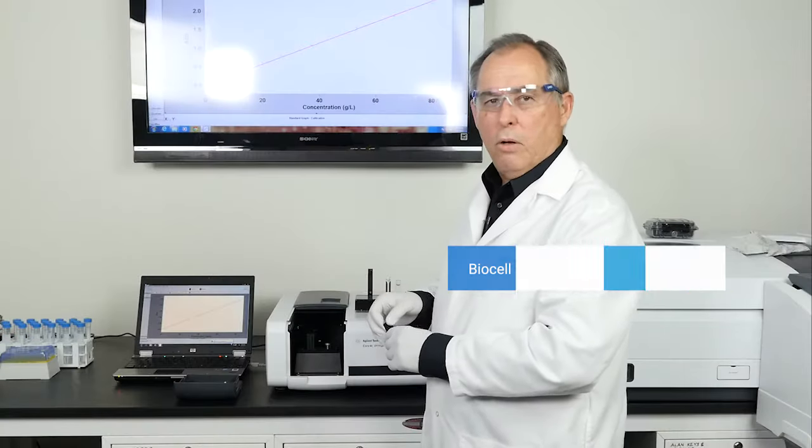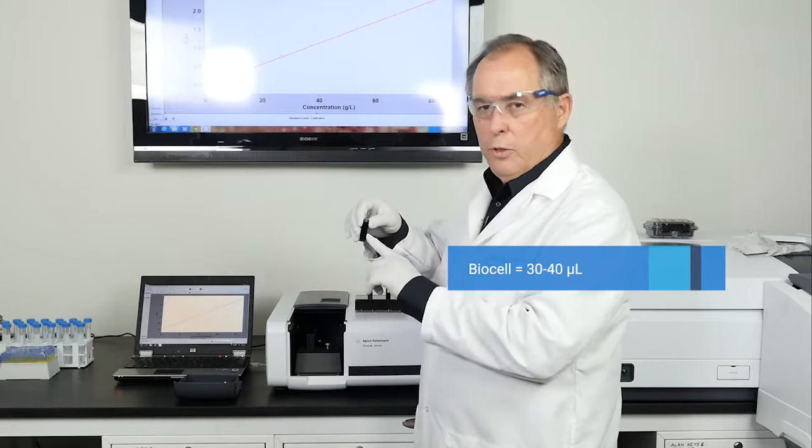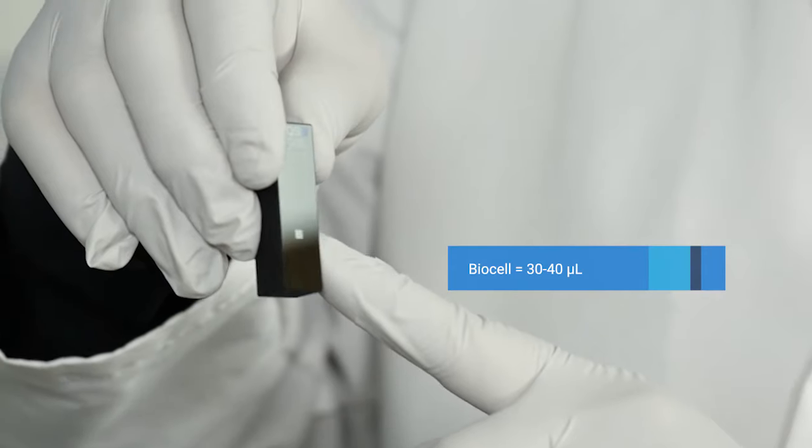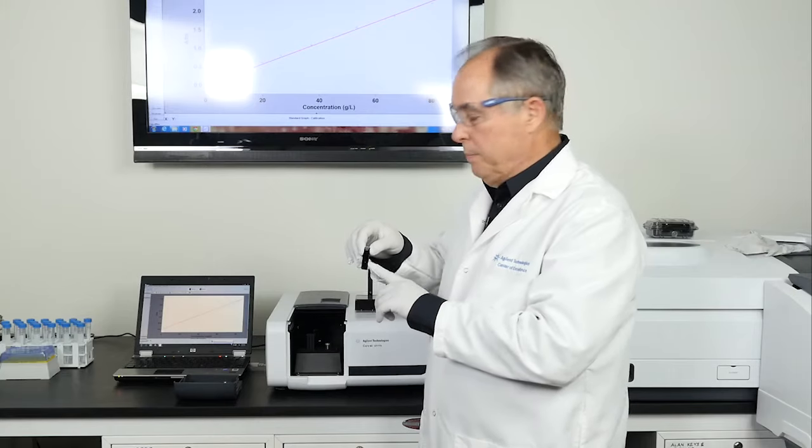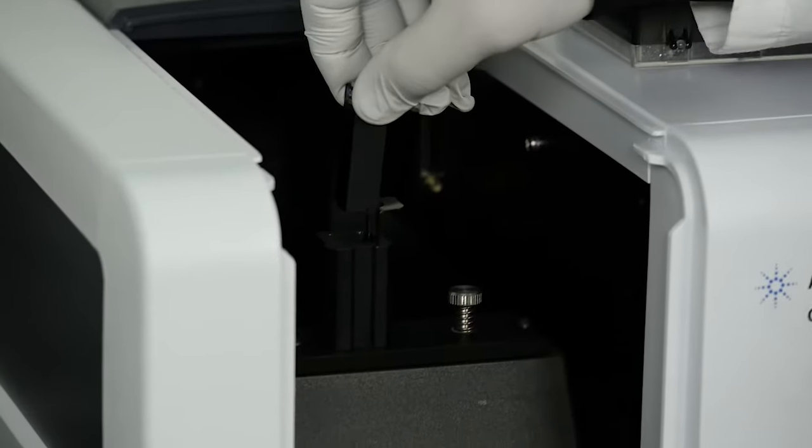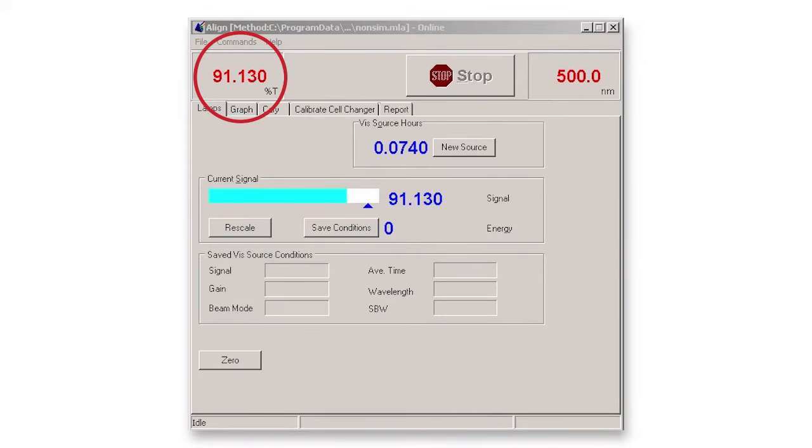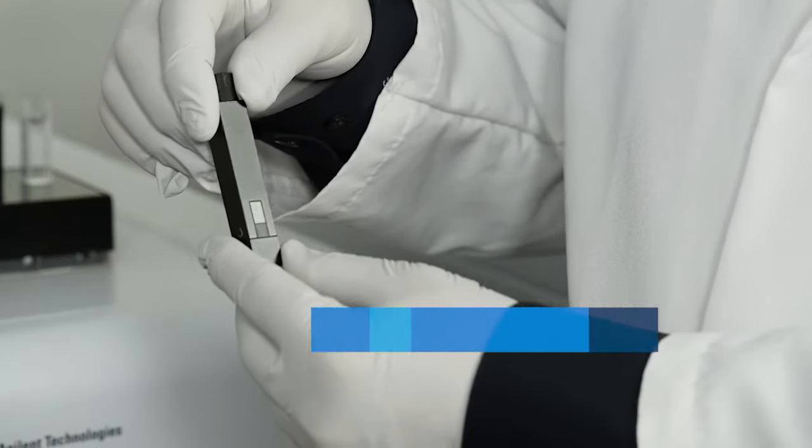The third cell we'll look at is called a bio cell. It has a very small window, it's reduced in volume to about 30 to 40 microliters, and again we'll measure this one.